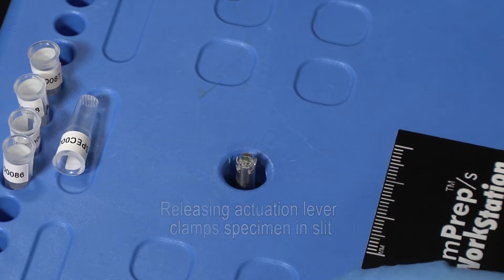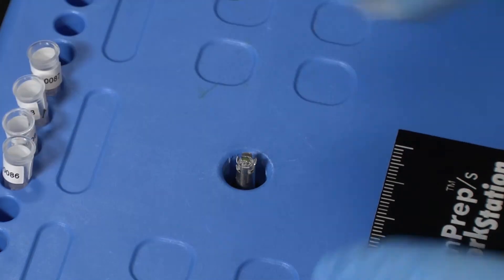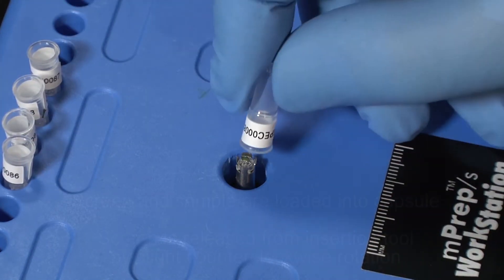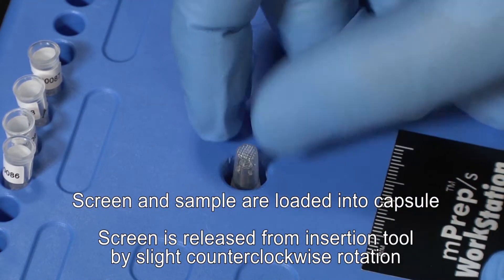An empty capsule is then slid over the insertion tool and rotated about one-eighth turn counterclockwise to release the screen from the tabs before lifting off.